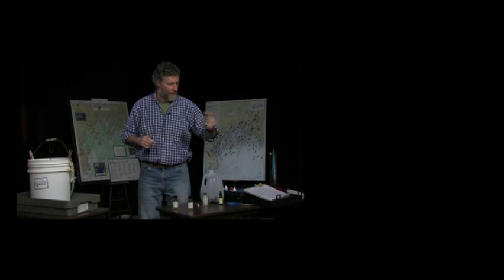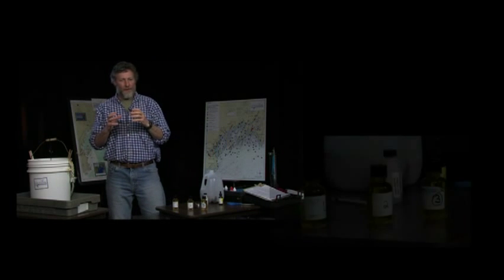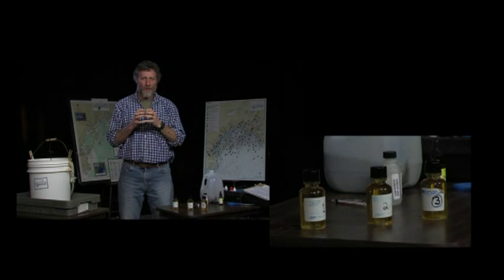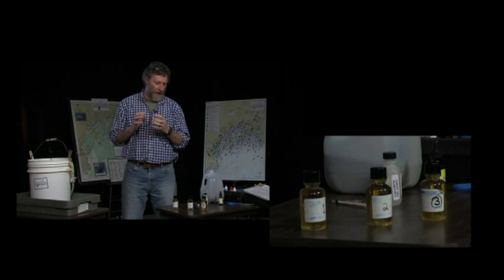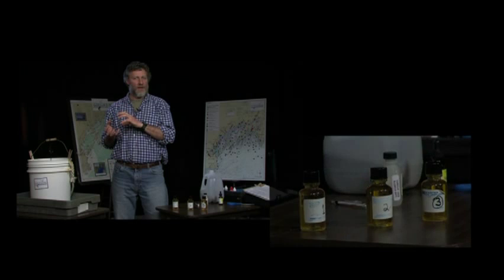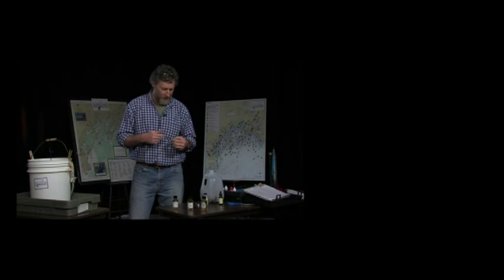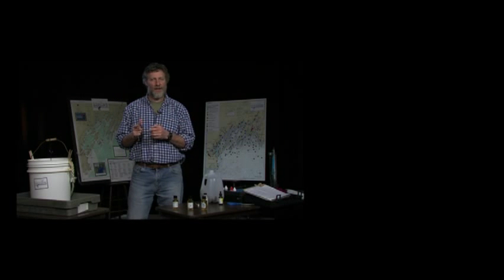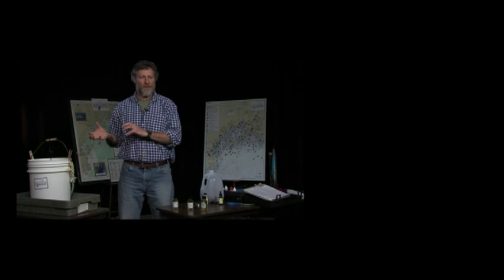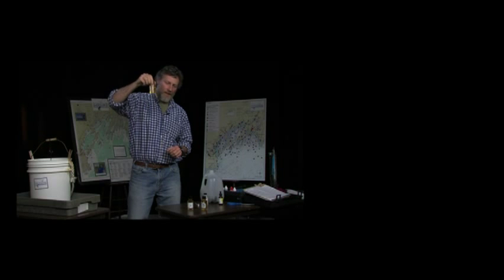Now you notice that it does have a little bit of a yellowish color to it. The process that we've done, we've collected the water sample, we added the 2 chemicals to it to bind it up to this white sort of cloudy precipitate. Now by adding the sulfuric acid to it, what we've done is we've converted the oxygen that's in the water into iodine. And so we now can add some chemicals to these samples to actually measure how much iodine there is in the water. And there's a direct correlation of the amount of iodine to the amount of oxygen. It's basically been oxygen's converted into iodine. So that's why we have this sort of yellowish look to it. It's iodine that's in the water.